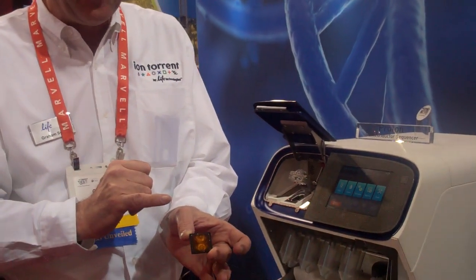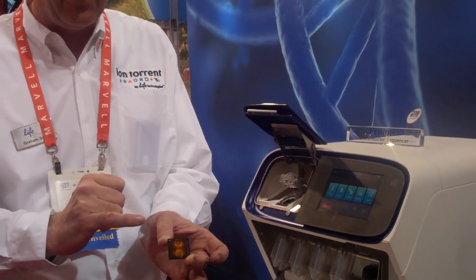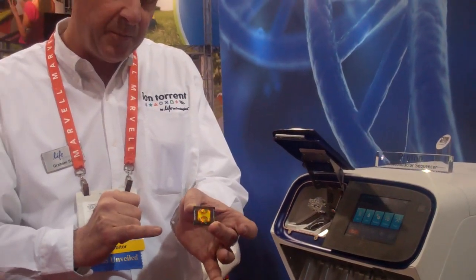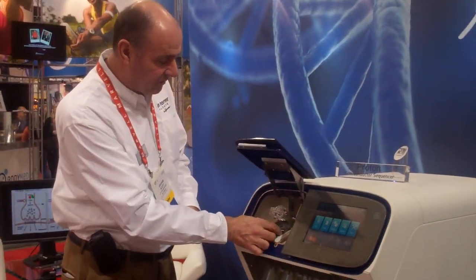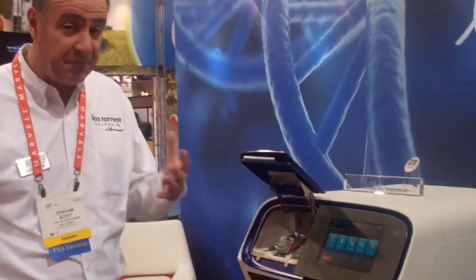This is semiconductor sequencing. The way this works is we're actually able to deposit millions of different DNA sequences into wells on this chip. We then put the chip on the instrument and we're able to introduce fluids and solutions onto the chip.